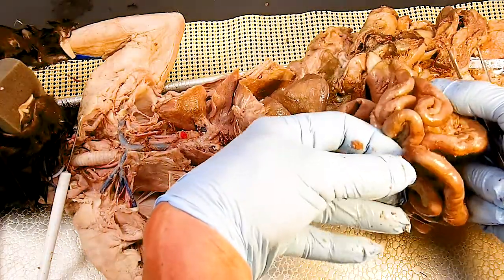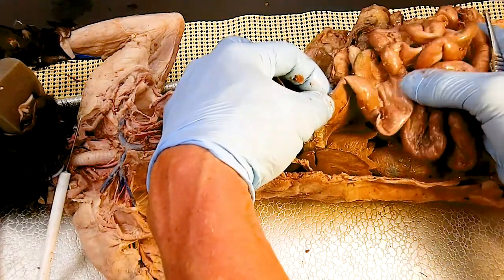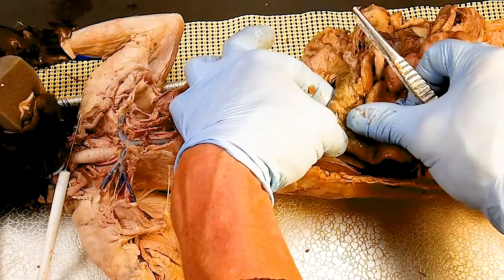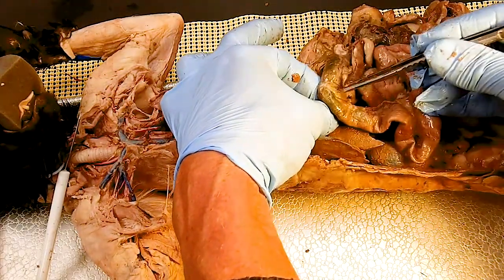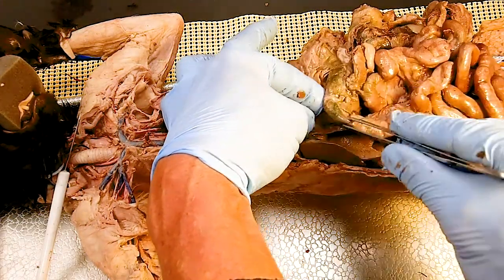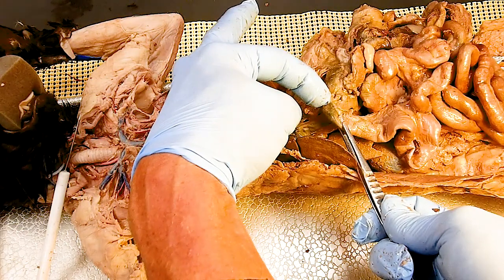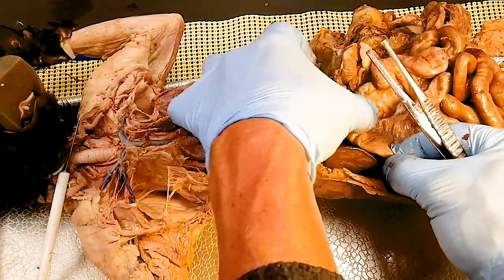Now the small intestine is typically separated into three regions: duodenum, jejunum, and ileum. Since I'm not having you learn the landmarks on the cat, we're not going to be too picky about it. But the first part of the small intestine, which would be about 12 inches in a human, is short in a cat as well, but not 12 inches. This is the duodenum. So if I wanted specific parts of the small intestine, if I'm very close to the stomach and ask you to be specific, the first bit of the small intestine is duodenum.